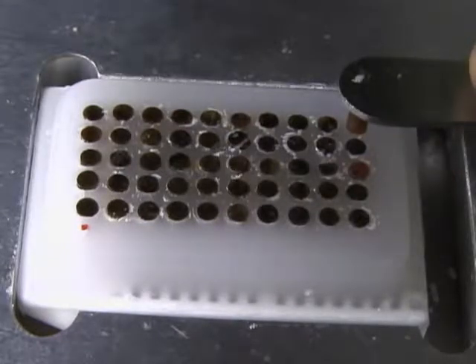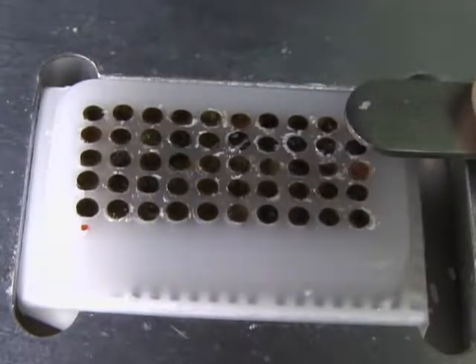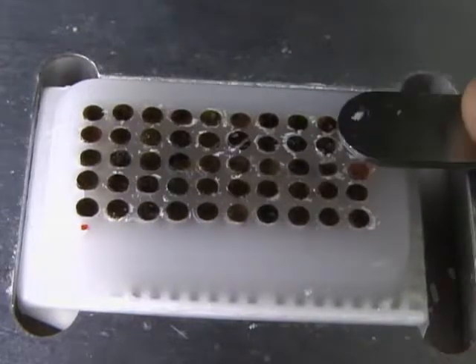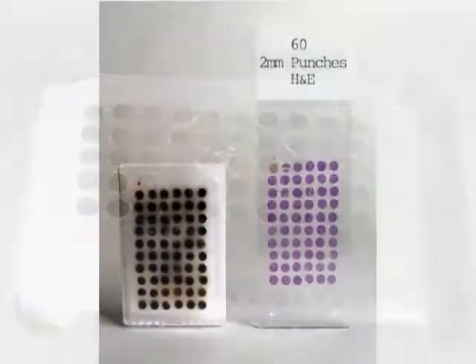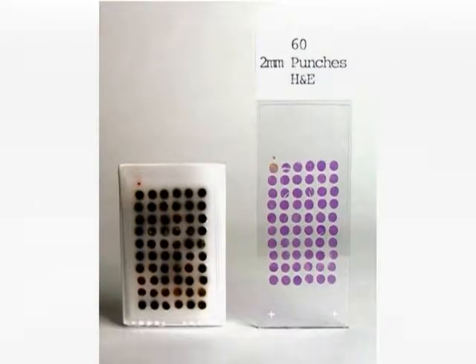Preparing the 2 millimeter array block for section is the same as this 0.6 millimeter block. Place it in a 37 to 40 degree Celsius oven for approximately 15 minutes. Then press together and cool on an ice block.